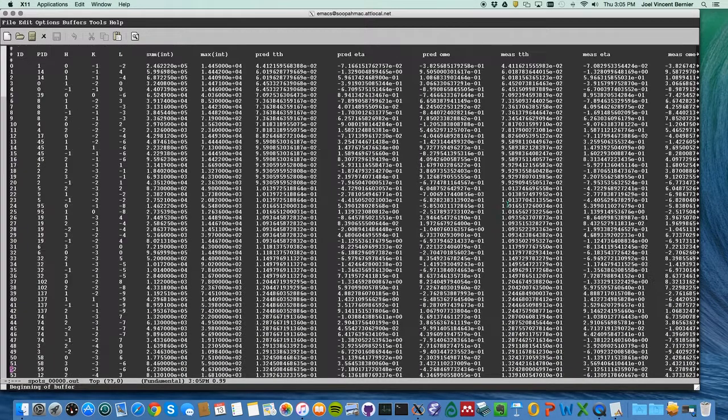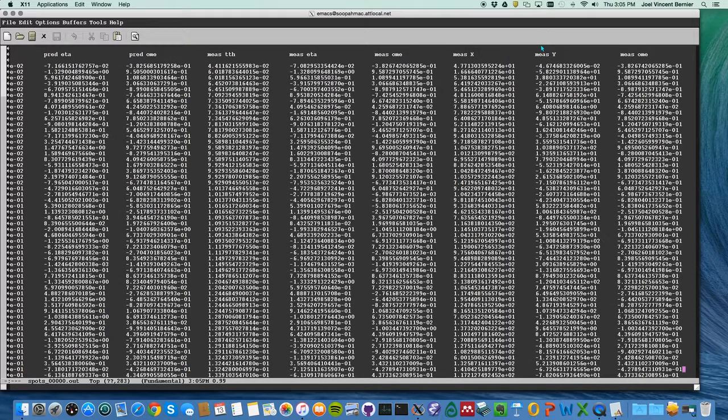And then last, instead of 2 theta, eta, omega, you have measured x, y, and omega, and this is in millimeters on the detector, in the detector frame. These things are used in the fit often, and then the measured omega is just copied, so I can easily take the last 3 columns and know I have everything I need to characterize a spot on the detector.